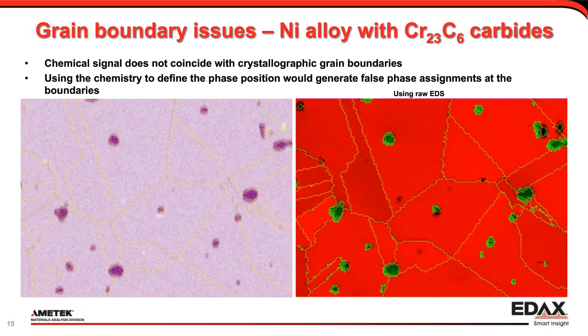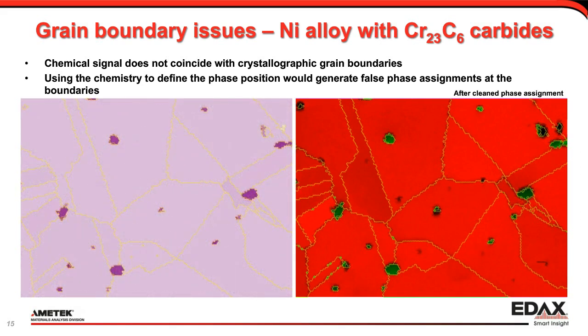to the nickel matrix. This would not only affect the grain size determination, but calculating a misorientation distribution from such a map would actually use orientations that are fully inside the nickel grains, which makes the misorientation distribution between the carbides and the nickel matrix invalid. After applying the EDS averaging inside each grain, the EDS map now displays the true carbide grain size, and also the reconstructed phase map is now correct.